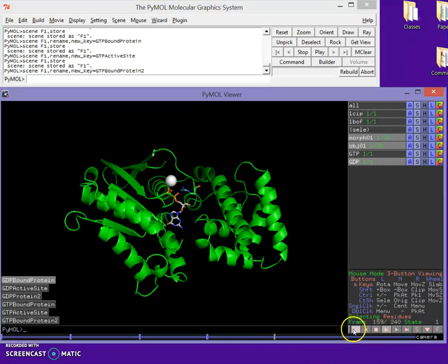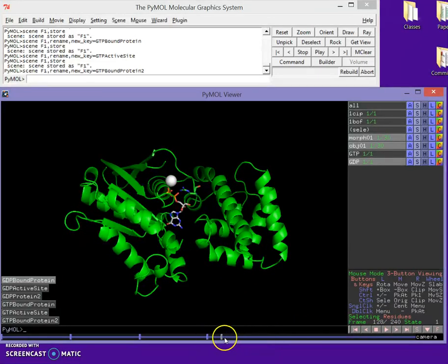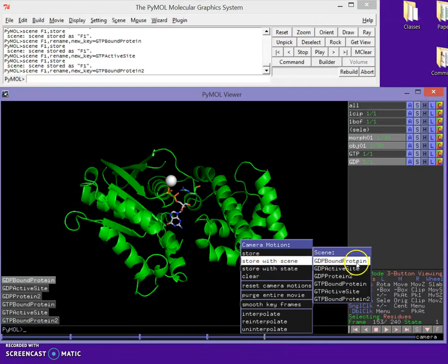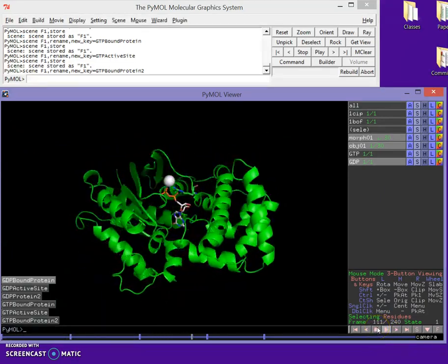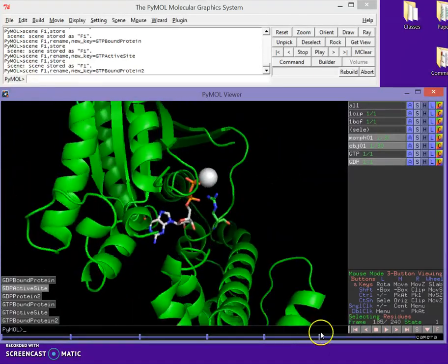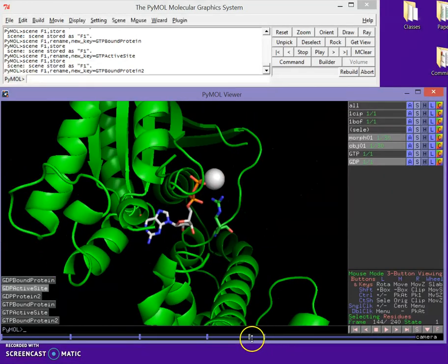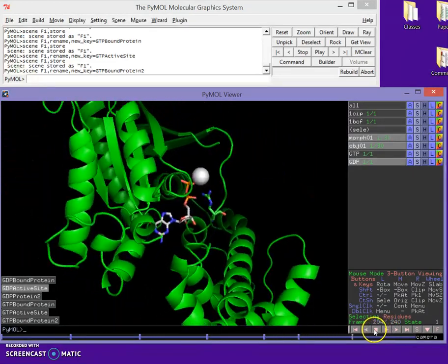If we played this movie now it would spin all the way around and then just hold. What I want to do is let it go a little ways, then program a zoom into the active site. I'll move the playhead to where I want the zoom to happen, right-click and Store with Scene 'GDP active site'. The movie will now spin and then zoom into the active site. To prevent it looping immediately, I'll hold Shift and right-click drag the keyframe out to create a hold at the active site.